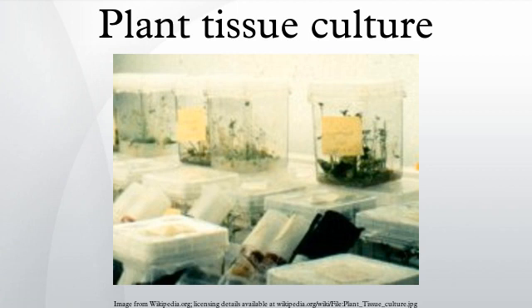Based on work with certain plants, particularly tobacco, it has often been claimed that a totipotent explant can be taken from any part of a plant, including portions of shoots, leaves, stems, flowers, roots and single, undifferentiated cells. However, this is not true for all plants. In many species, explants of various organs vary in their rates of growth and regeneration, while some do not grow at all. The choice of explant material also determines if the plantlets developed via tissue culture are haploid or diploid. Also, the risk of microbial contamination is increased with inappropriate explants.